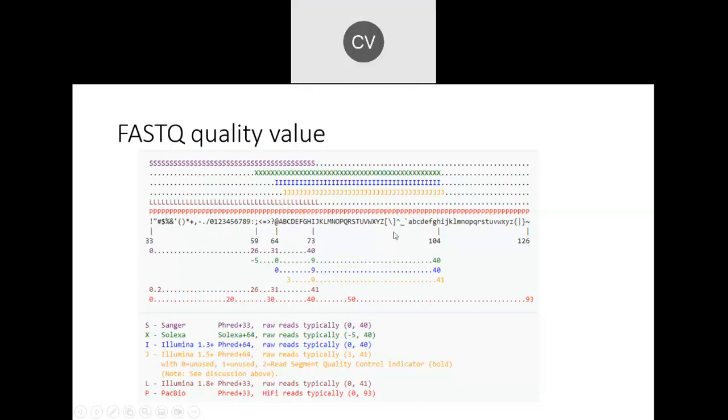Excuse me, sir. All these are the raw reads, like these 4-5 lines above? These are not the raw reads. These are the encodings here. Typically a FASTQ file will have all these encodings, for all the systems. So depending on the FASTQ file you receive, there is the possibility that you get the Phred 64 encoding sometimes. Sometimes you get the Phred plus 33. And sometimes you also get the Solexa 64, like the older data. If you get any old data set, you might get the 64 encoding there also.